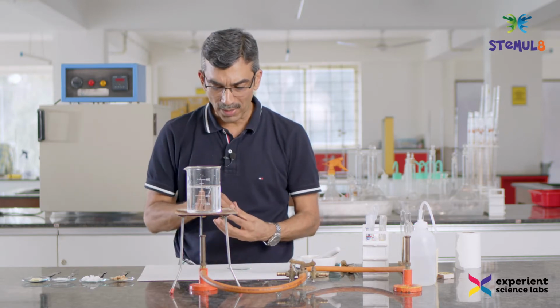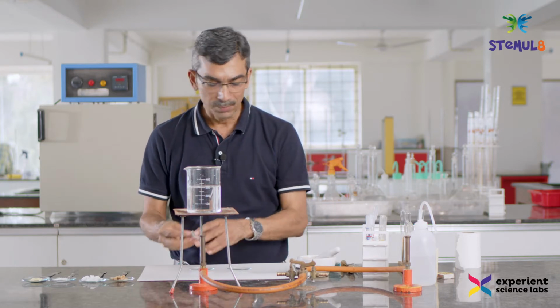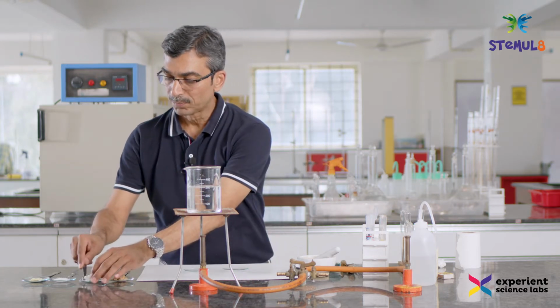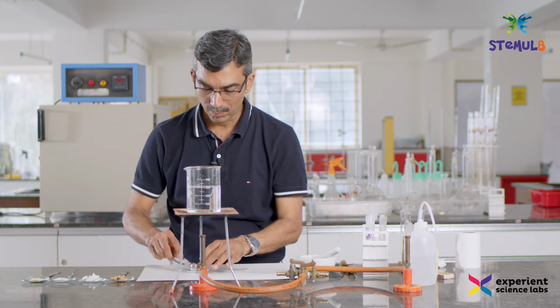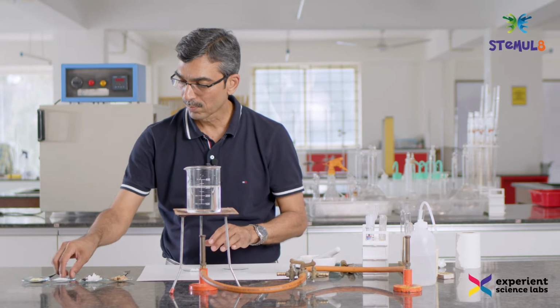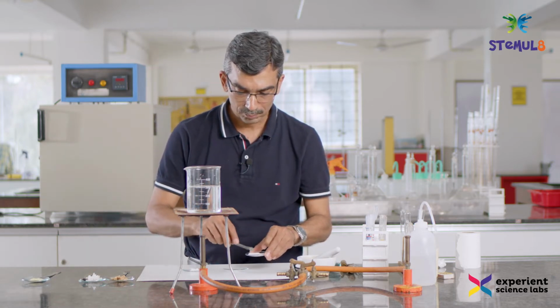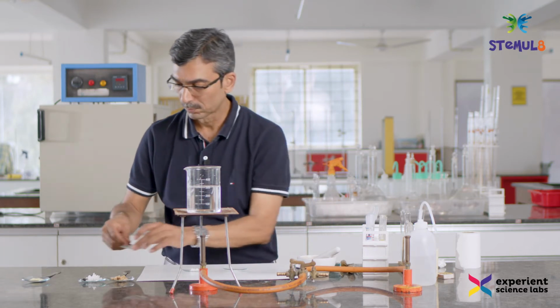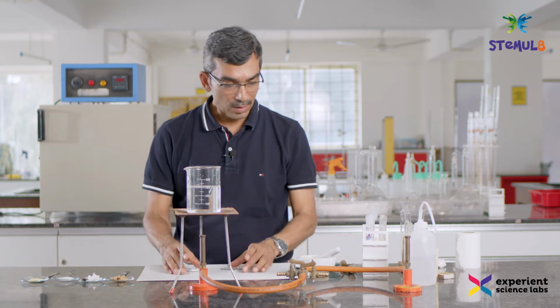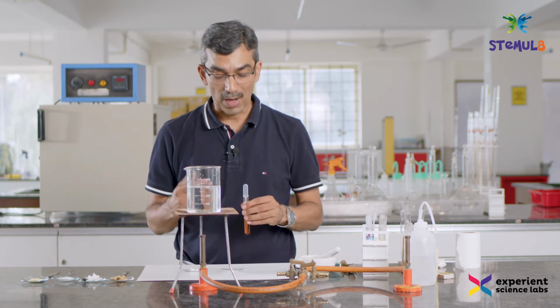I am using this white background so that you can actually see the change of color very clearly when it happens. So let me start with rice. As I said earlier, for testing the presence of starch, we use iodine.